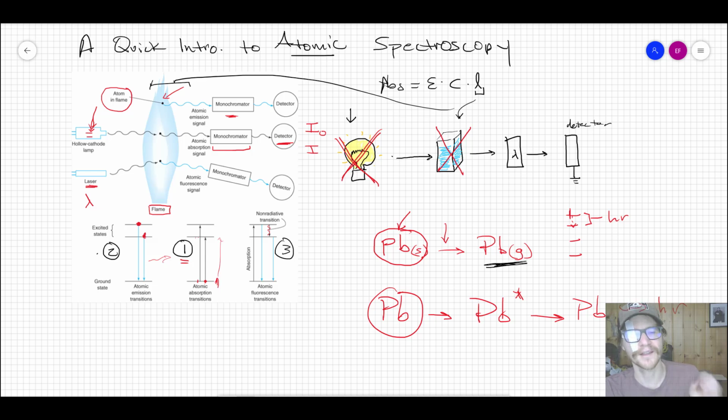So it's got one wavelength, and it emits a flux of photons that are coherent, collimated typically, and pretty intense. So you have a high density of photons. And so what that does is it just pumps a bunch of ground state electrons into a higher energy state, and you can dial that in specifically for the atom that you're interested in, and then it will fluoresce.